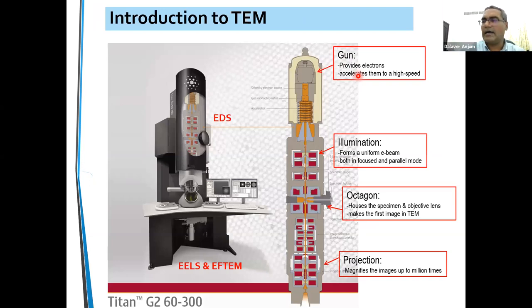So now I think after enough introduction about various things, let's talk about the real instrument this talk is about. Here is a schematic of a transmission electron microscope column. This is how it looks, and we're looking at the cross-section here. It has lots of modules in it, starting with the electron gun. It's called a gun, not an electron flood or something, because it shoots one electron at a time. That's what the gun does, it shoots one bullet at a time.